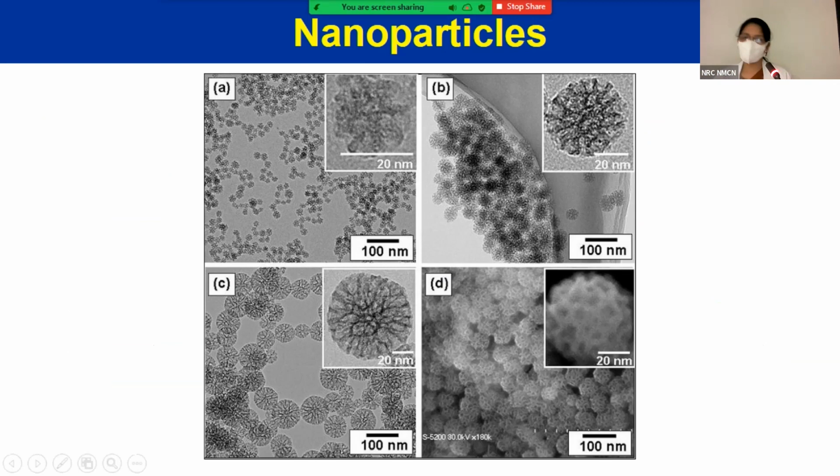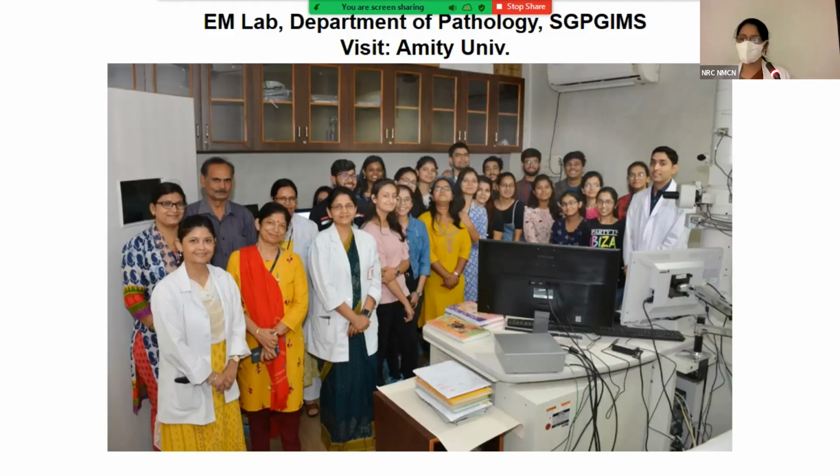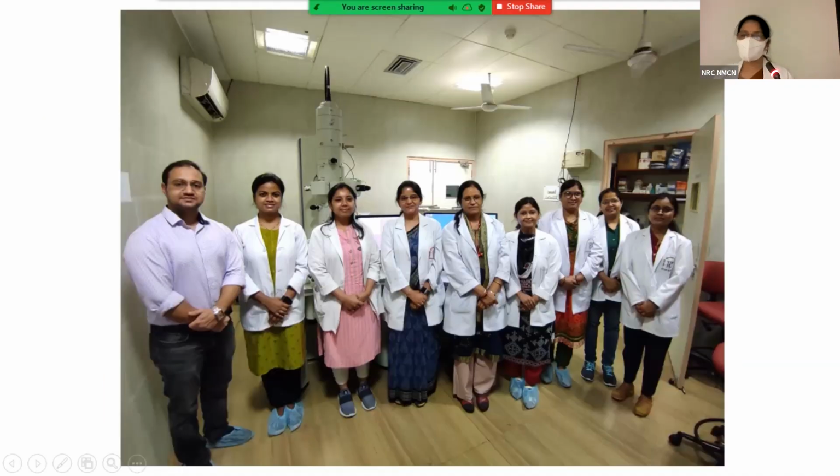Okay, so biomaterial things. We keep on having students from the universities who keep coming for visualizing electron, and this is our electron microscope. This is a column. And this is our team in electron microscopy, our technician, Madhulika, Farat, and some of my peers. Okay, any questions?